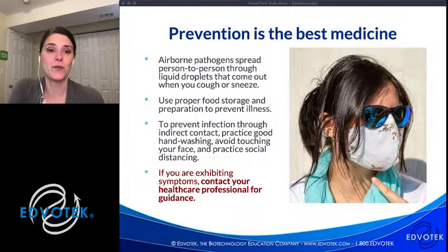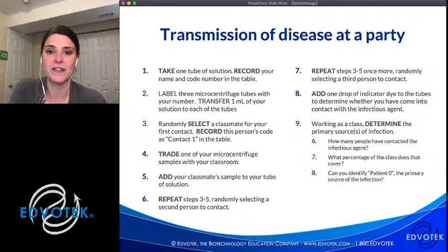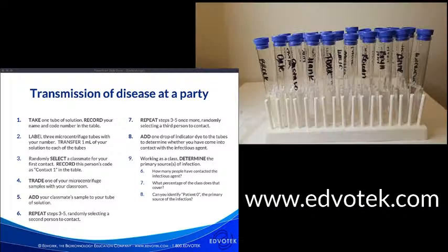Okay, so we are going to perform a simple experiment that's going to allow us to chart the spread of a disease through a community. So let me just go to my setup. Let me get my camera started. And we will talk about the experiment. So we are going to be doing disease transmission in a test tube.